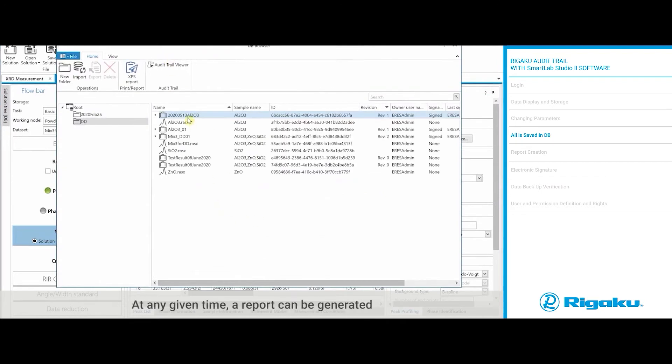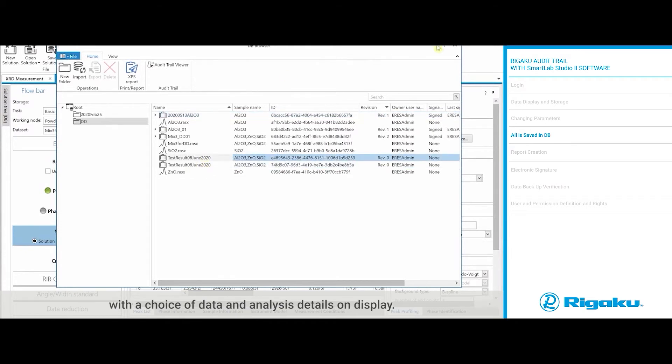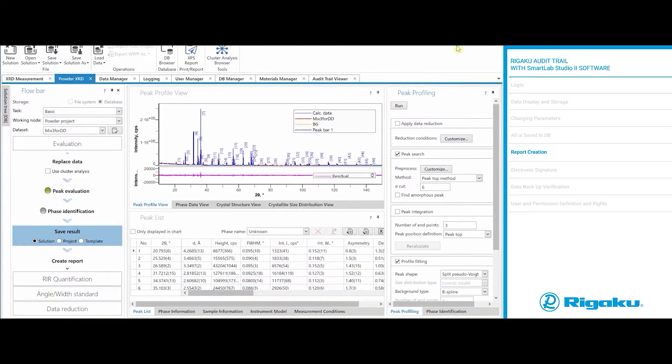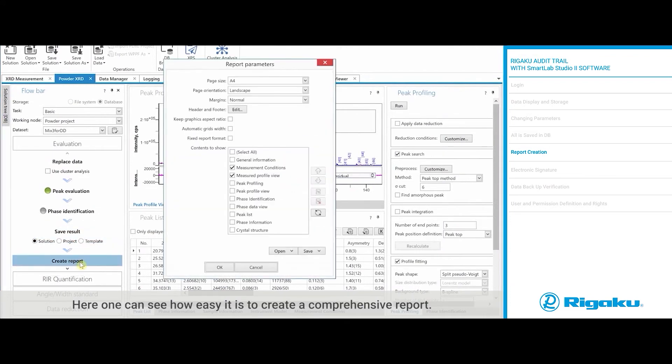At any given time, a report can be generated with a choice of data and analysis details on display. Here one can see how easy it is to create a comprehensive report.